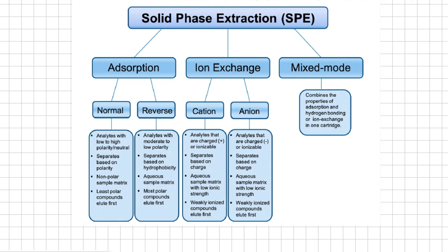Where we will use normal phase and where we will use reverse phase depends upon various factors. In normal phase adsorption solid phase extraction, analytes with low to high polarity and neutrals will be analyzed. The separation is based on polarity. The non-polar phase is the sample matrix, whereas the least polar compounds will be eluted out first.